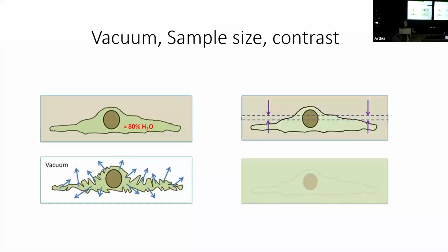Population of the cells in your pellet comes into play here. So if you have enough cells in your section, you can hope or assume that they're all cut at different planes. And so you could reconstruct, if you wanted to, a whole cell based on the information that it's a small section in each part. And also biological material is basically transparent. The only reason we can see each other is because we're thick enough, right? Otherwise we're invisible. So we're going to have to do some sort of contrast enhancement.